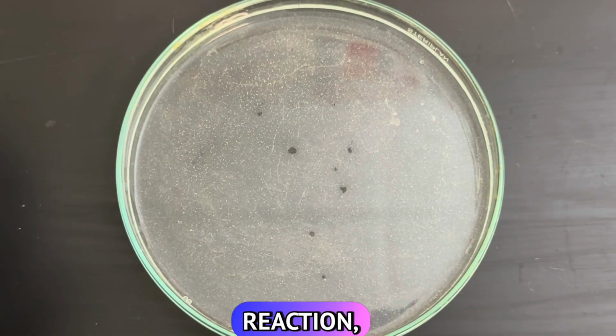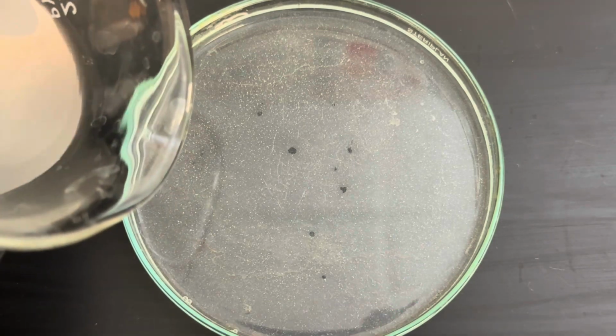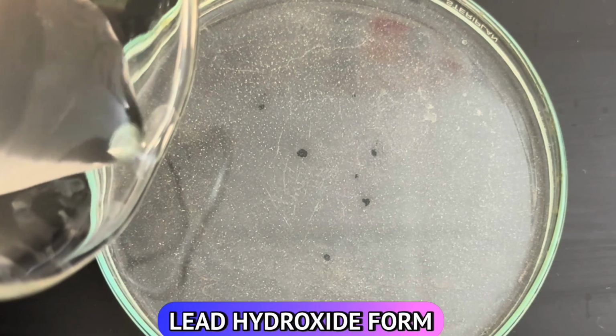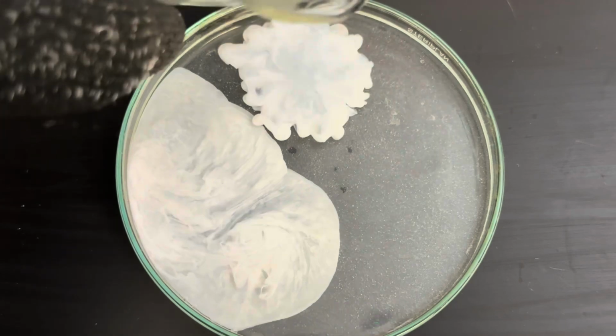Here's another view of the same reaction, only in a petri dish. We're going to add our potassium hydroxide, and again you'll see that white precipitate of lead hydroxide form immediately. Look at that.